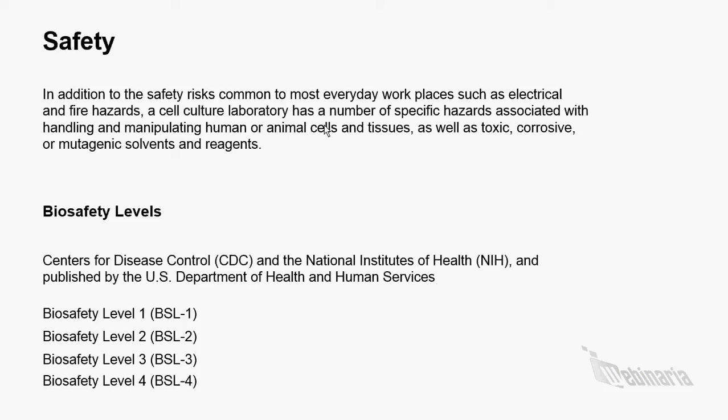So you have to be very, very careful. The fundamental objective of any biosafety program is to reduce or eliminate exposure of laboratory workers and the outside environment to potentially harmful biological agents. The most important element of safety in a cell culture laboratory is the strict adherence to standard microbiological practices and techniques.